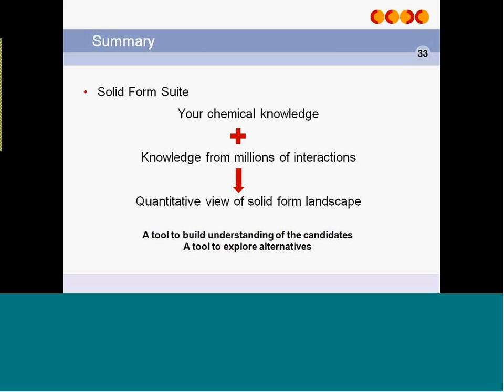But really, by presenting that quantitative view of the solid form landscape, it really should allow you to understand, to build up that understanding of your candidates through the drug development process. It's also a tool to explore alternatives, and I've not really talked about that in this webinar, but that's the topic of the webinar given by my colleague, Dr. Pete Wood, in a few weeks' time, talking about using this tool for co-crystal design.